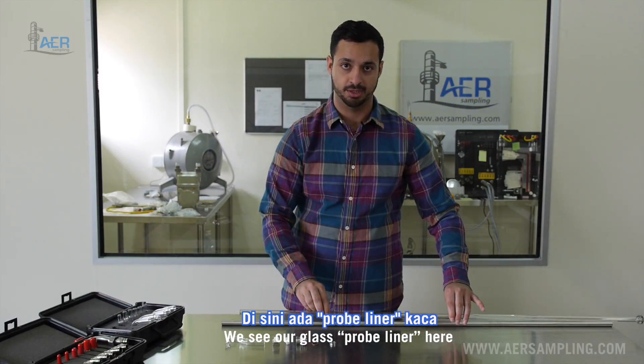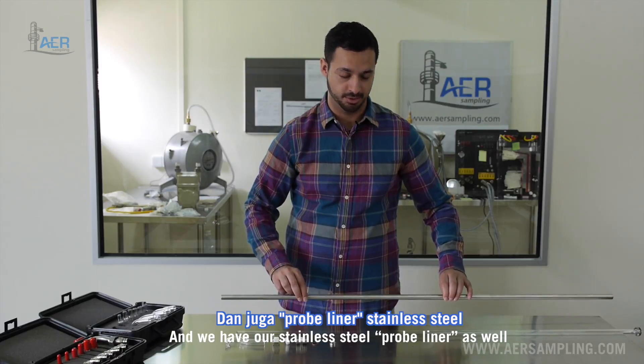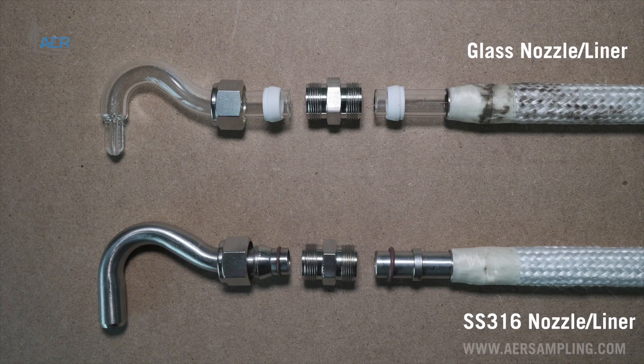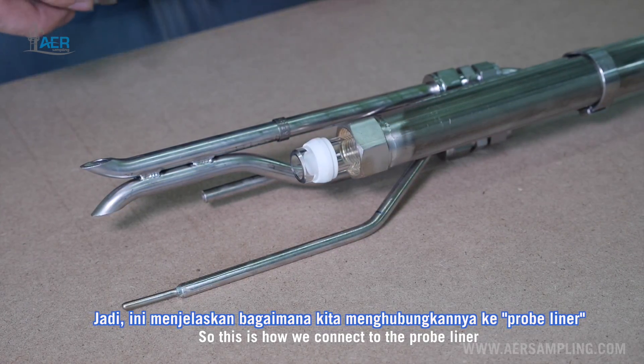We see our glass probe liner here, and we have our stainless steel probe liner as well. So we have our nut, our Teflon ferrule, our union, our o-ring, and the backer ring. This is how we'll connect to the probe liner.